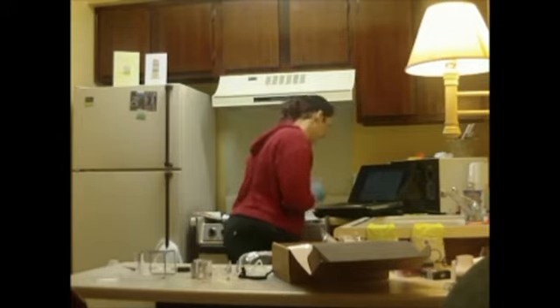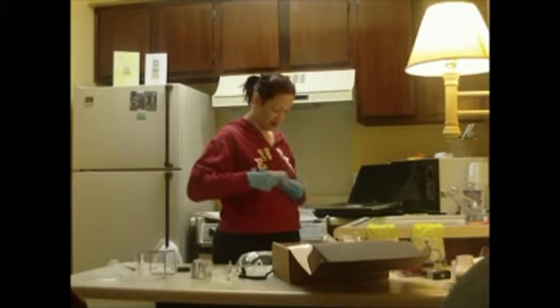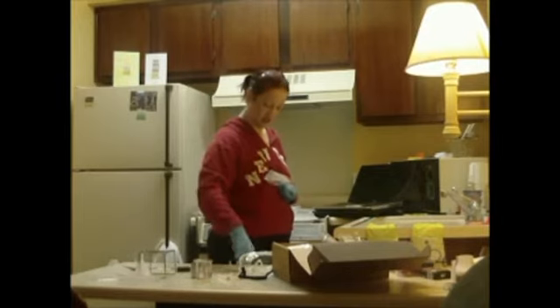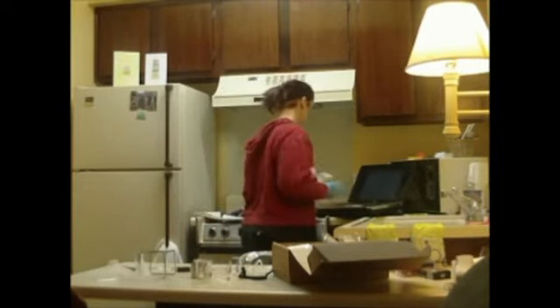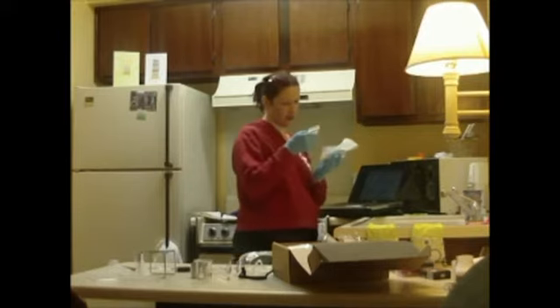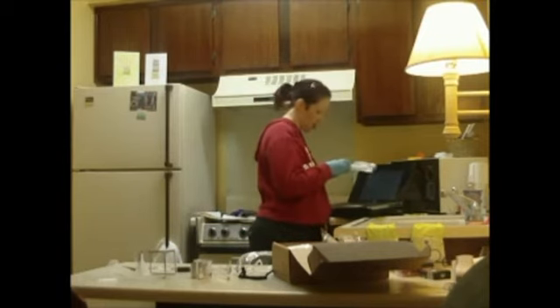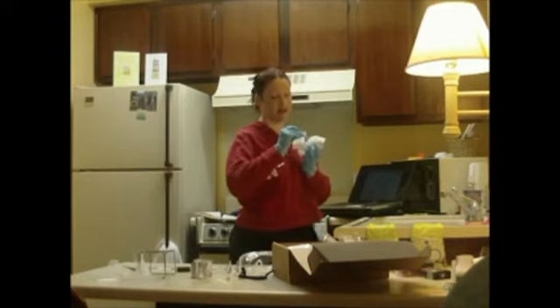Then we have hydrochloric acid, 4 milliliters in a dropper bottle. Hydrochloric acid. This is it. Corrosive. See why I'm wearing the gloves. Okay. Magnesium metal pieces, 6 to 8 in bag. We've got plenty of them here. These are magnesium metal pieces. And then magnesium oxide powder. This is magnesium oxide powder. Avoid contact with eyes and skin.